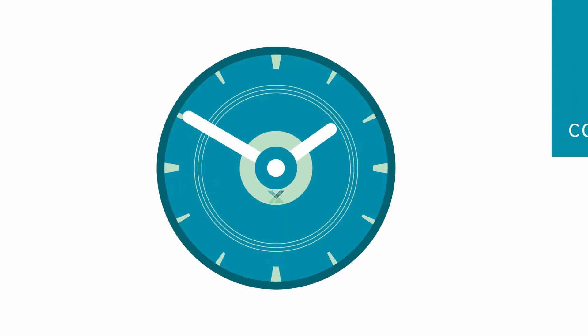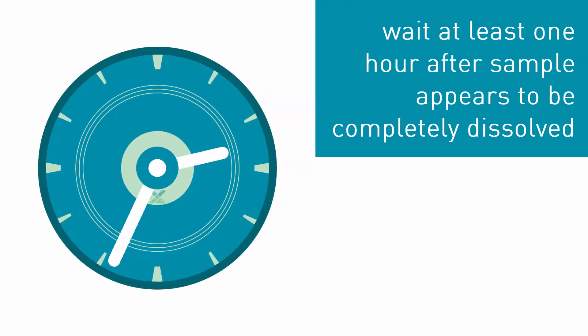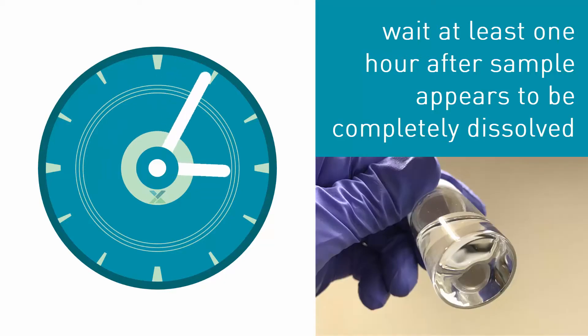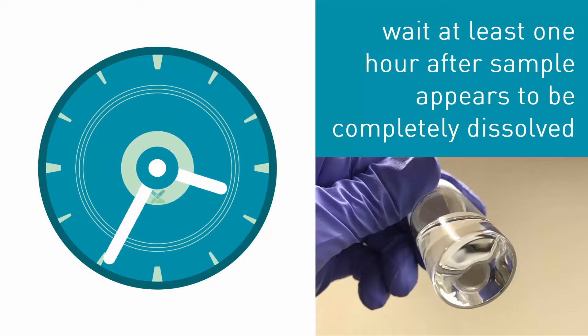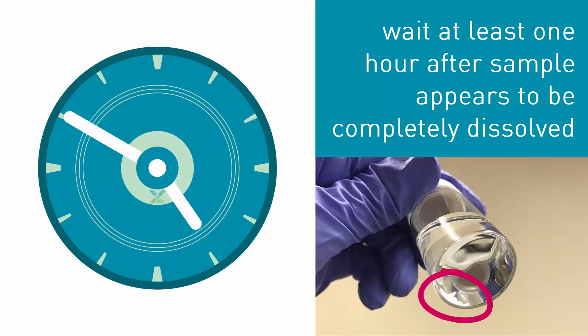Let the sample dissolve for an adequate amount of time. A good rule is to wait an extra hour after it appears to have completely dissolved. Periodically examine the sample solution to make sure the sample is not stuck to the side of the vial or has begun to gel instead of dissolve.